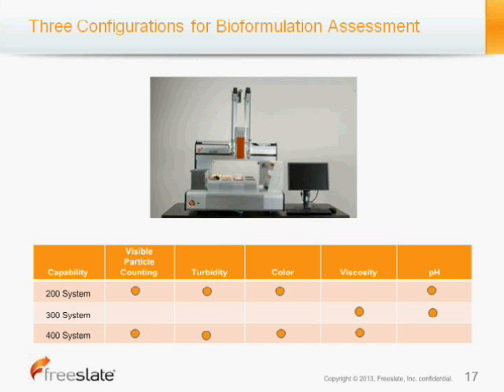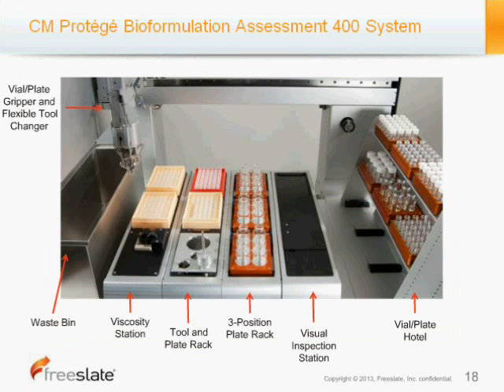Just as an example of the deck layout for a Protégé system, we have a picture here of the Protégé Bioformulation Assessment 400 system. What you can see in the upper left-hand corner is the vial plate gripper and flexible tool changer, which we use to move plates around the deck.